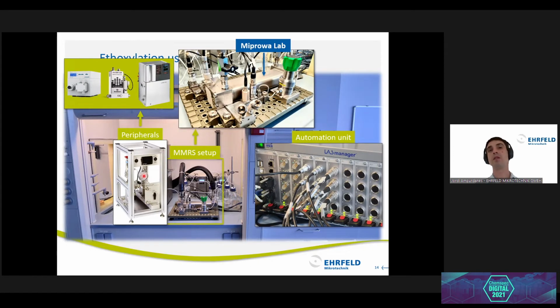So this would be an all-in-one. This was regarding how the setup looks to run a continuous ethoxylation in laboratory scale.